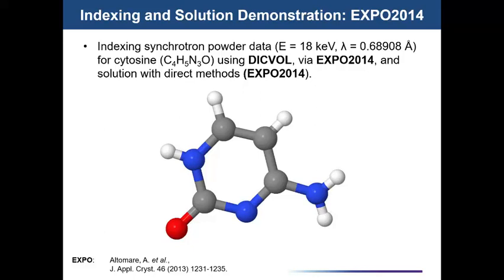The volume of our cell is about 4 times as large as that. That's another good sign. A lot of orthorhombic structures are going to have 4 or 8 molecules in the unit cell because of the multiplicity associated with an orthorhombic cell. So if I stick a 4 on the end of this, you'll notice I'm now getting a cell contents of just over 500 cubic angstroms, and it's pretty close to the volume of the unit cell.